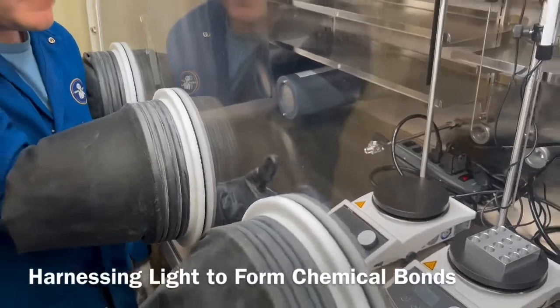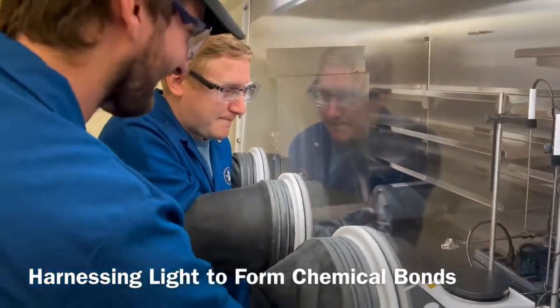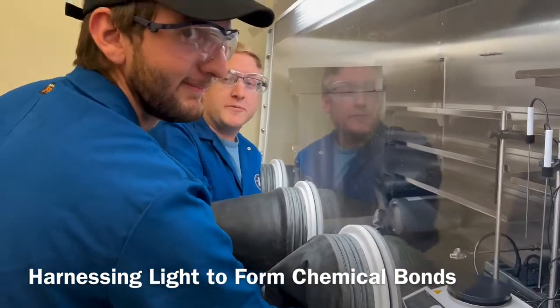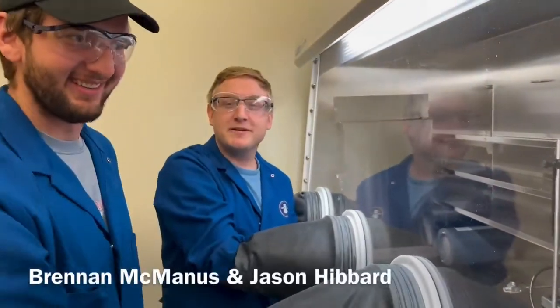Three, four, I.D. Clary, Thumb, and War. Oh, well this is embarrassing. Welcome to the Bahamundi Lab. We're going to take some time to show you what we do around here.